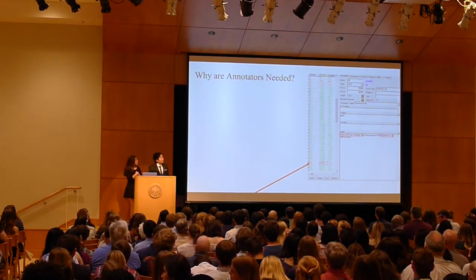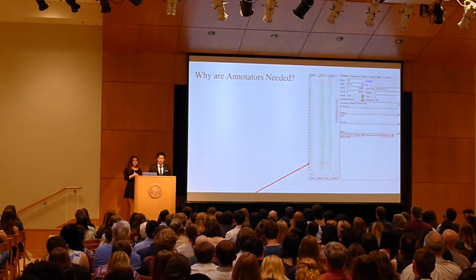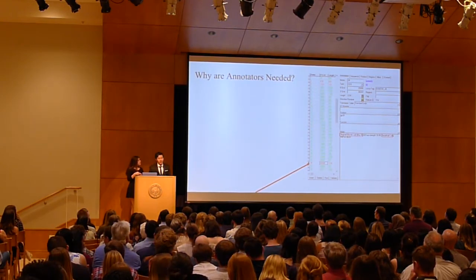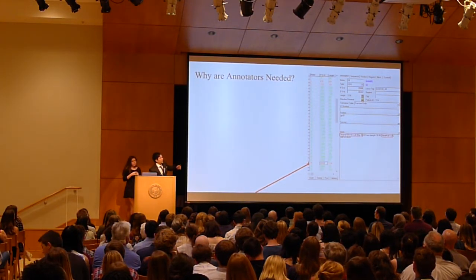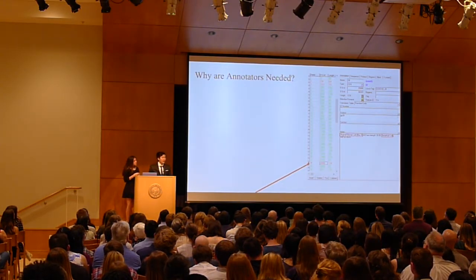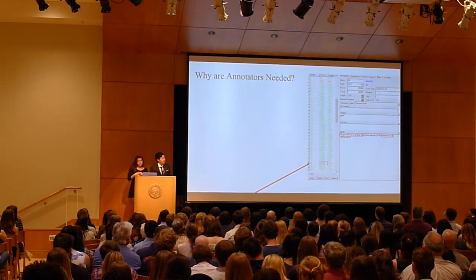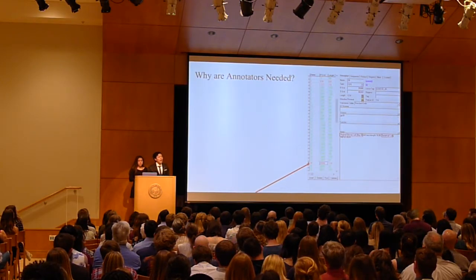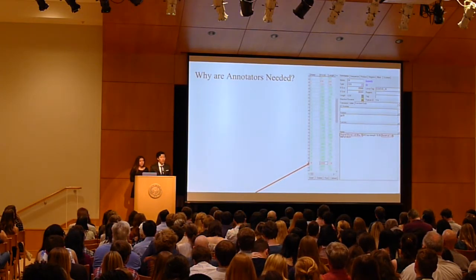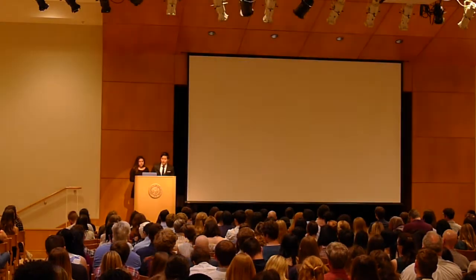Now we have many bioinformatic tools, as Kay has said, but sometimes they can't make the calls. For example, in this DNA Master display of gene 28, you see the red box there. That is two different kinds of bioinformatic tools, Glimmer and GeneMark, calling a different start. So as the annotator, we have to collect as much evidence as we can, and based on all this evidence, we would finally determine the start and the function of the genes.